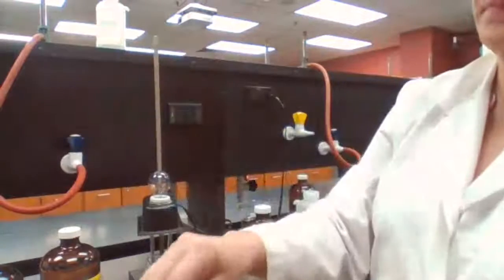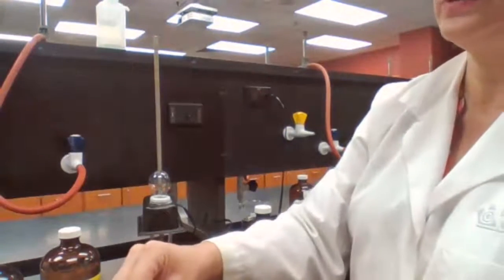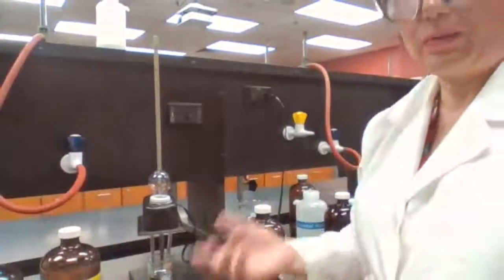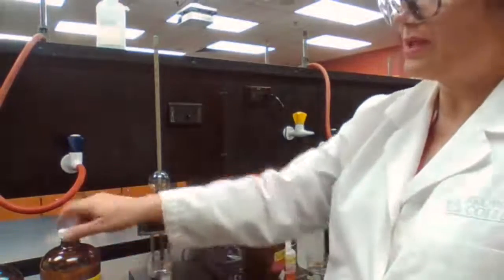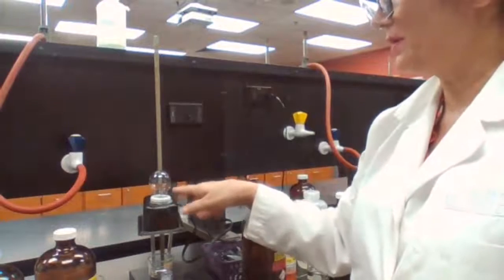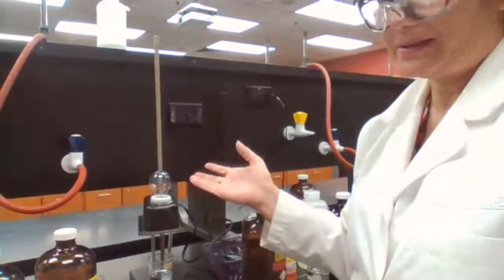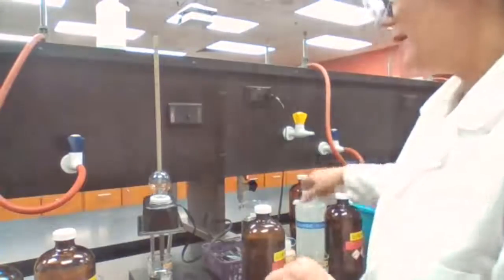The table is on page 64, and the topic is the effect of solvent. We want to use the solvent toluene to try to dissociate the acetic acid. If it does dissociate, it would light up the light bulb. But since it doesn't, we can say that this solvent is not dissociating.